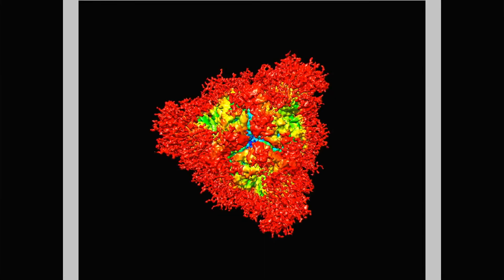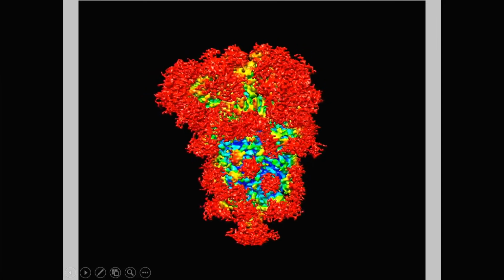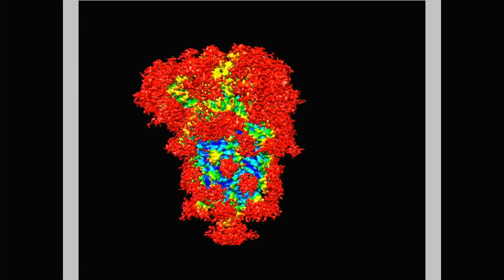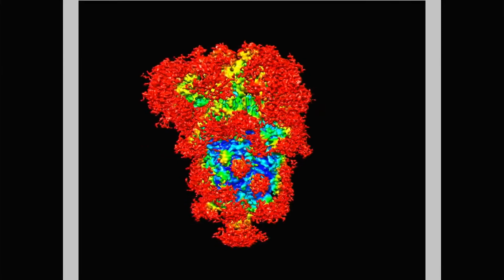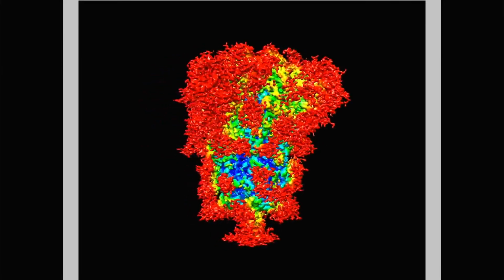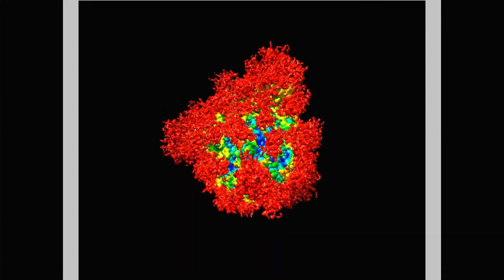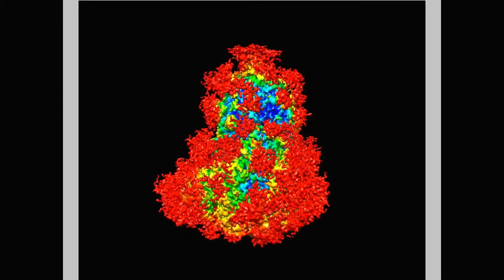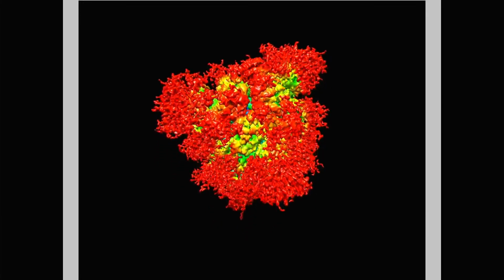This is exactly the same story, but at a different threshold level. Again, you see that one still has to scale these things. We have a project going on together with collaborators from São Paulo to look at the flexibilities and the resolution as a function of place, for all 1,000 spike proteins that have been deposited in the PDB structural database.